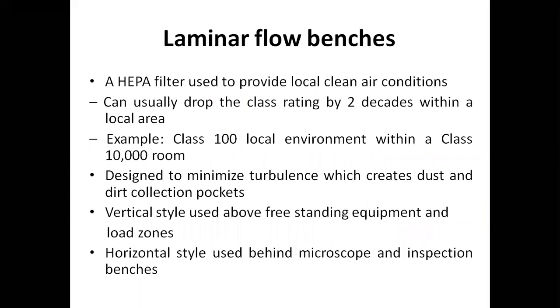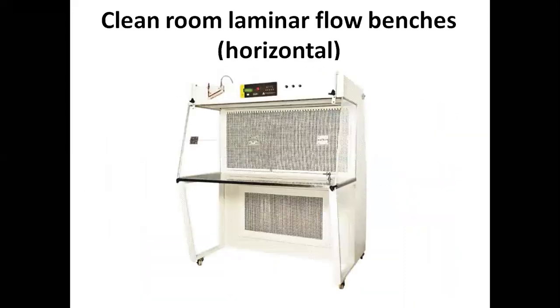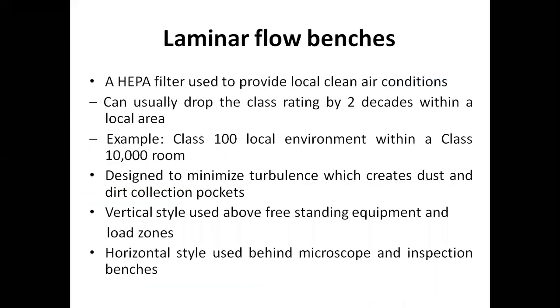Also in the clean room, we would have laminar flow benches, and normally you have to work inside the laminar flow bench. This is the cross section of a laminar flow bench, and you can see the photograph. This is the photograph of a laminar flow bench. Here you have to work. You have to do your fabrication inside the laminar flow bench. So this slide is about the laminar flow benches.